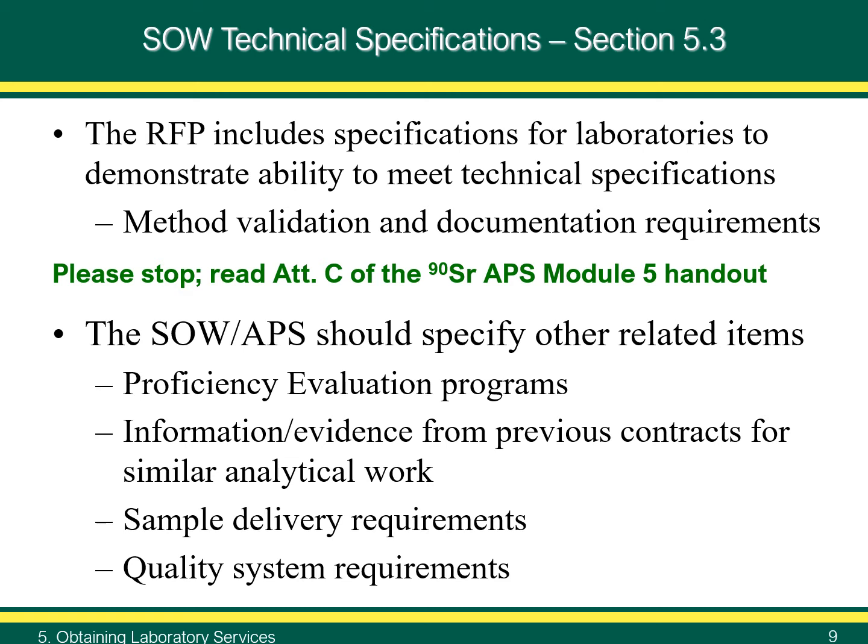The SOW and APS must also address quality management system requirements. Attachment B of our example APS addresses an important requirement for the laboratory's quality management system. It defines the quality control samples that the laboratory must run to provide evidence that analytical processes will meet MQOs.